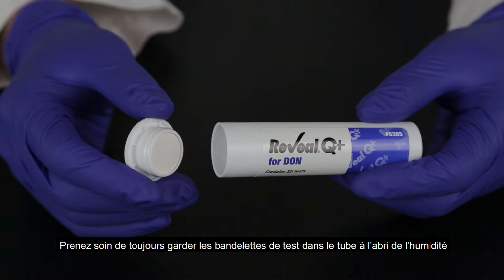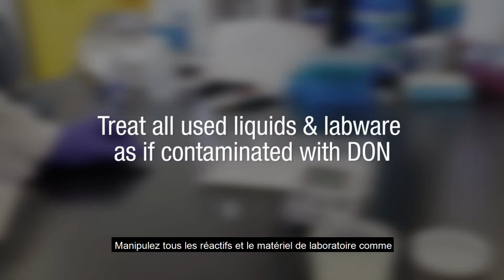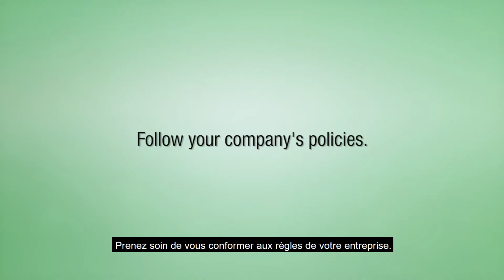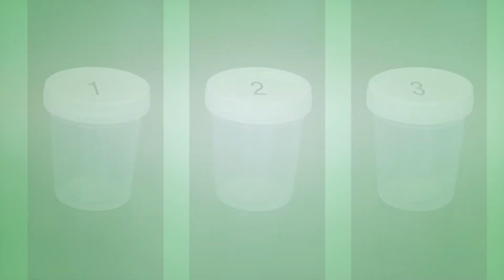Remember to always store test strips in the Stay Dry tube at room temperature. Do not freeze the test strips. Treat all used liquids and labware as if contaminated with DON. Neogen recommends gloves and other protective apparel, although they're not required during testing. Be sure to follow your company's policies. Avoid cross-contamination by using clean extraction supplies for each sample.